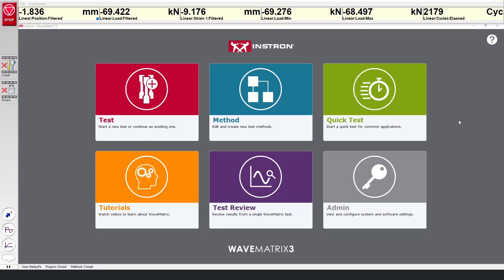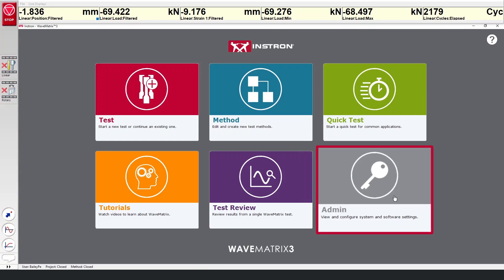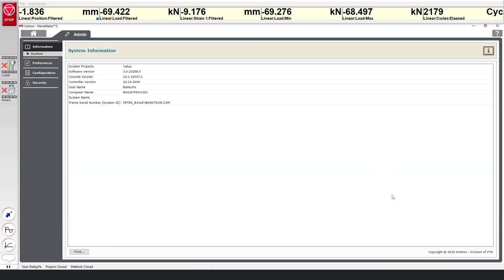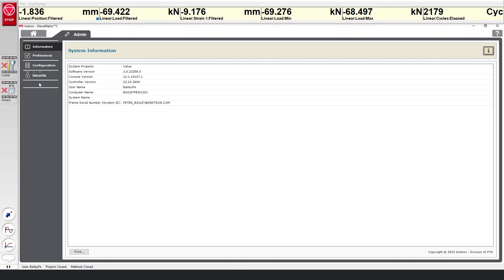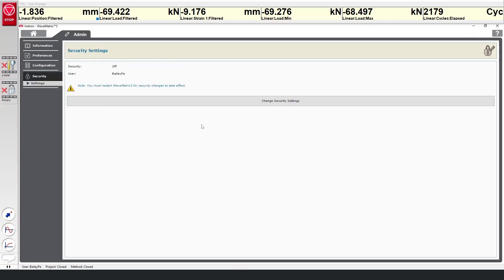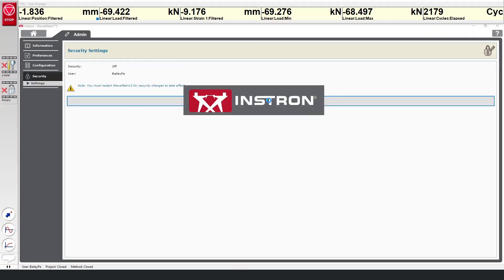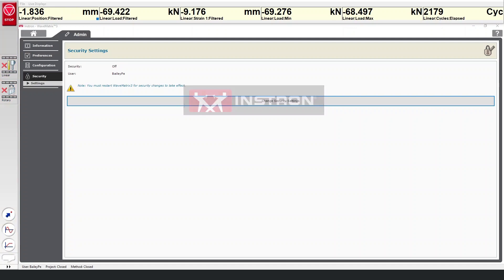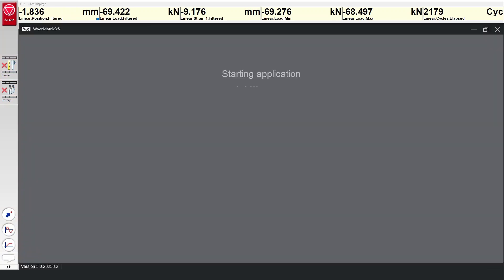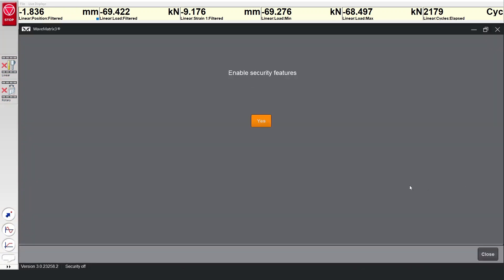To enable the access control feature in Wavematrix, go to the admin area from the home screen, then select Security and click the button to launch Security Management in a new window. Now click to enable security features.